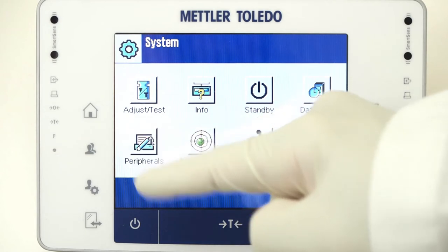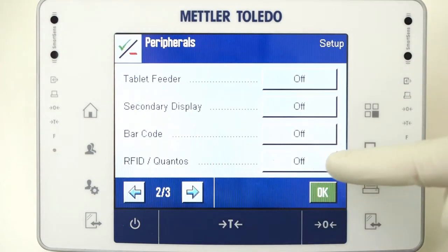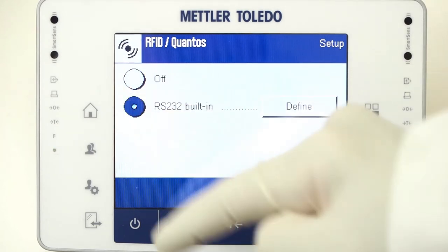At the bottom, page down to page 2, and by RFID/Quantos, press the button. Select RS-232, built in, and then Define.